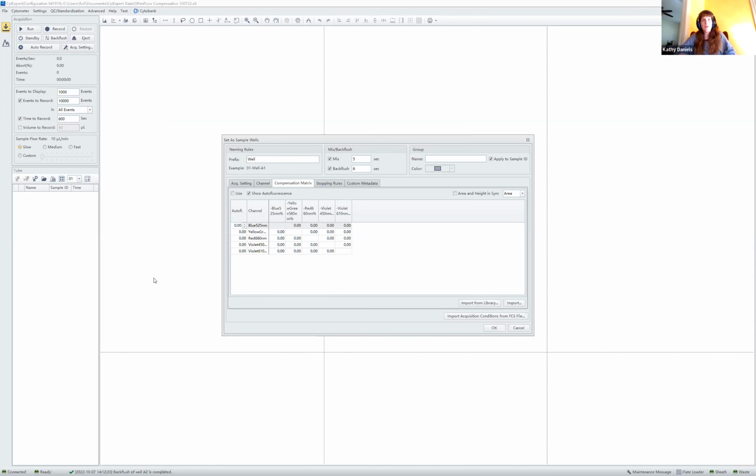Yeah, and I'll just add on to that. Those are all great points, Rui. I've definitely seen some comp issues running experiments on the CytoFLEX. I redo the comp with the same exact controls in third-party software, and everything replicates the same way. So it's typically, like Rui was saying, those controls; they're not as bright, it's not matched, things like that. And I think it drives home the point that you need to run on each instrument, and the best thing is to identify those appropriate controls and run them each time.